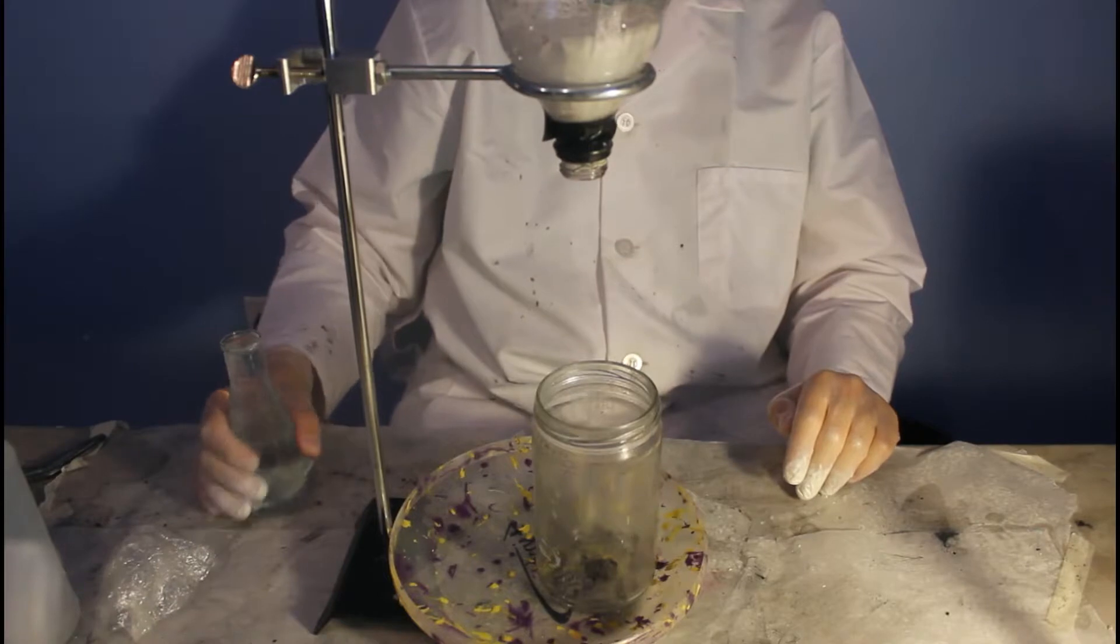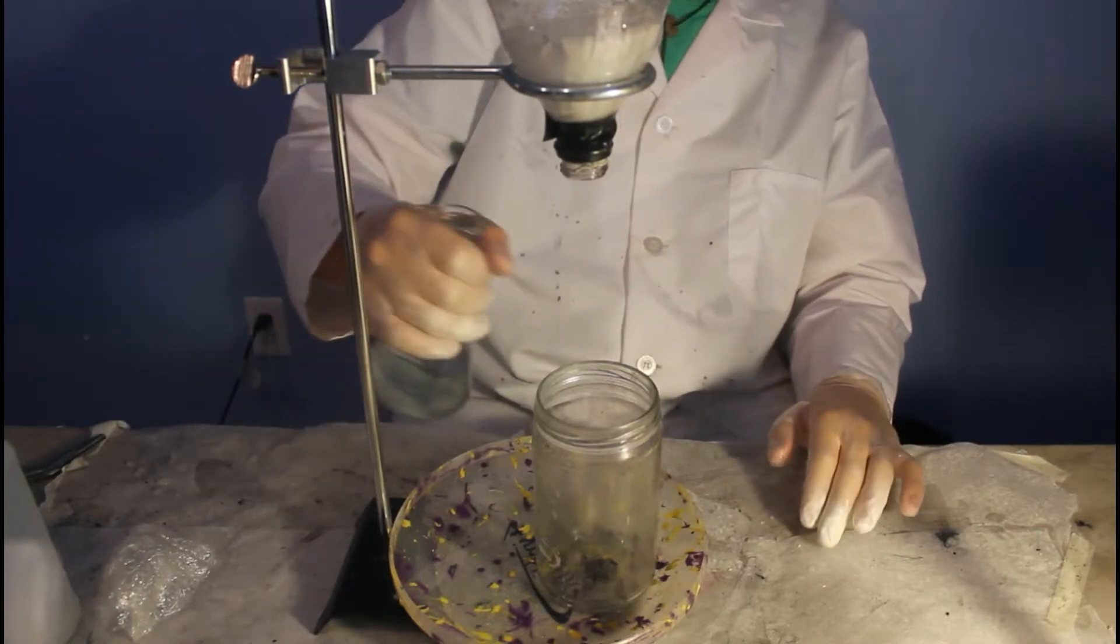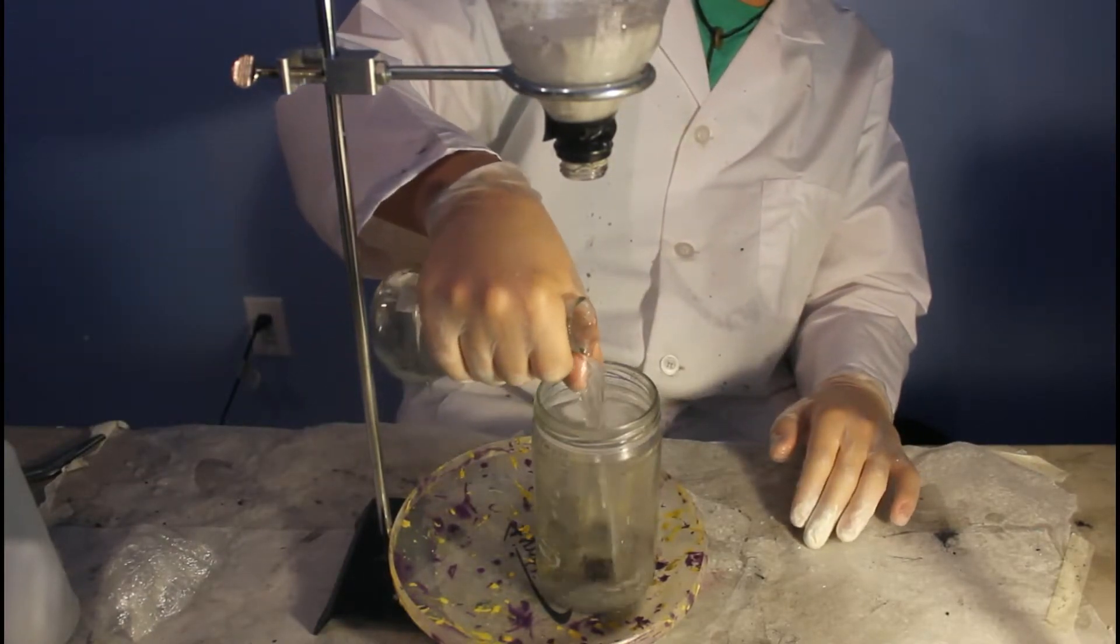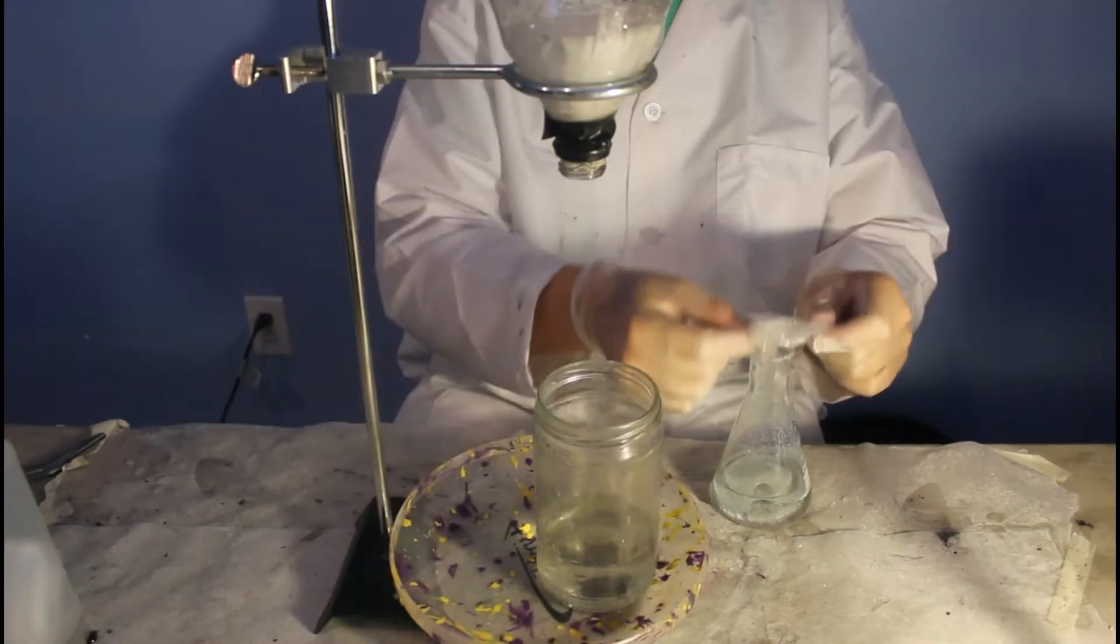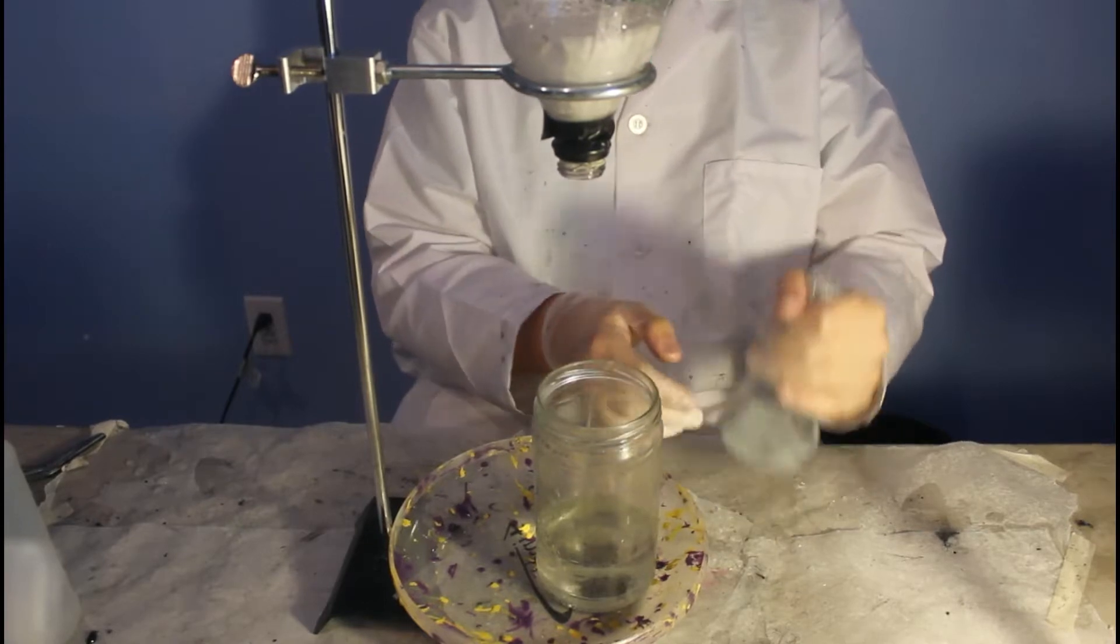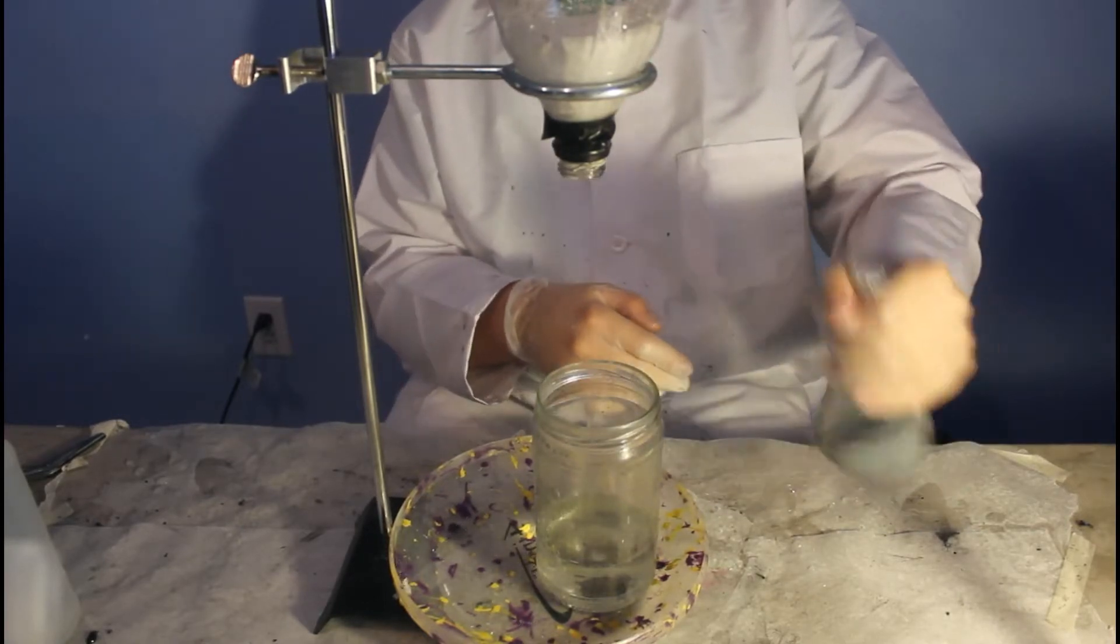The flask is uncapped and most of the water is decanted off of the top. Plastic wrap is applied to the top and the flask is shaken to get as much zinc in suspension as possible.